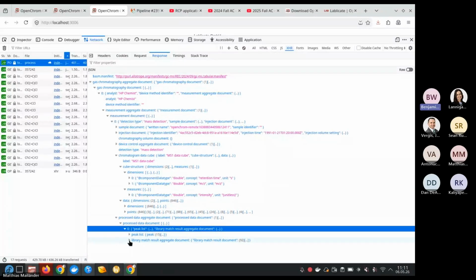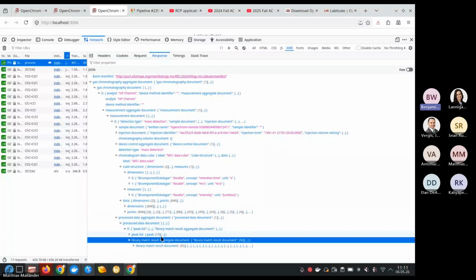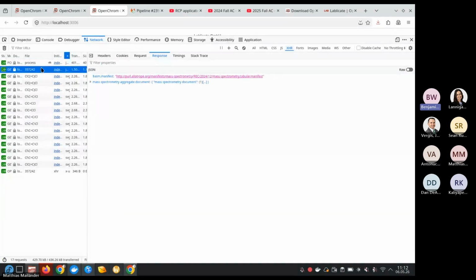And you can see here, actually everything in here, also the library matching that you saw. And maybe you now see the full picture why I pushed for all of these small elements, these additions that we recently added to the standard. I'm not a huge fan of vendor additions or proprietary fields. So we just submitted everything as a standard. People looked at it, gave us some hints on what we can improve, and the JSON schema and some manifest that people have put thought into also really helps the front end developer to do this a lot faster.